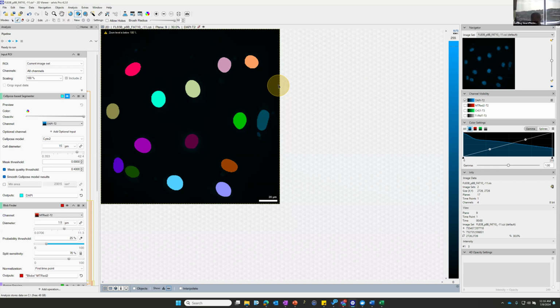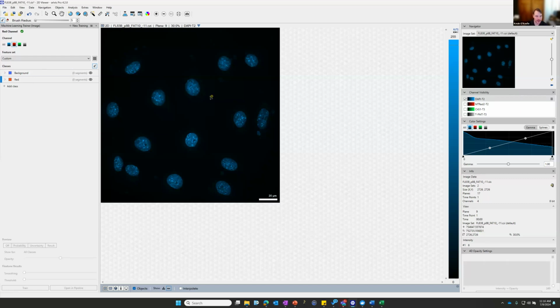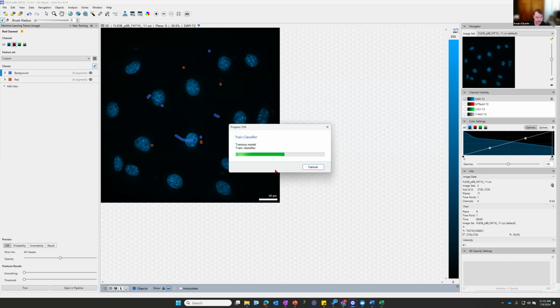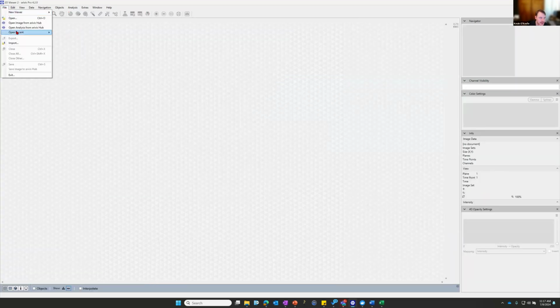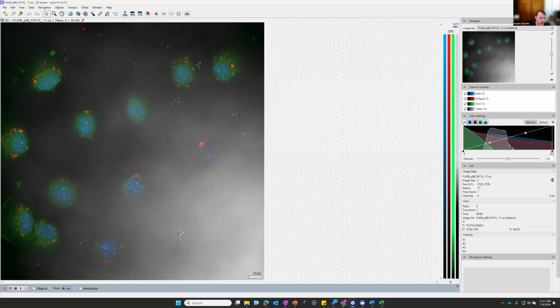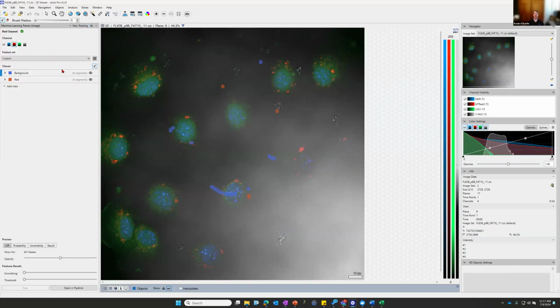Okay. So all those trained models are saved in the .sis file, right? Yep. So if I were to, let's hit save. Let me make sure I have something saved here. Oh, I deleted them. Let me do it real quick. So I'm just going to put gibberish down right now. Yada, I'll do training. And then I'm going to just save the file, exit it out, close this, reopen it. And it's saved to the .sis file. So all my annotations are going to be saved. The training is going to be saved. Any of these image sets that I import are all going to be saved to the .sis file.